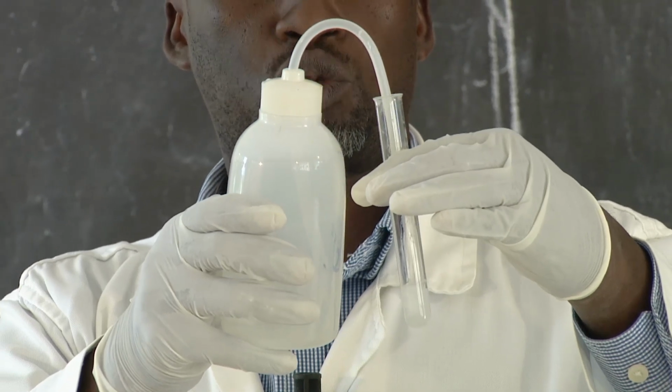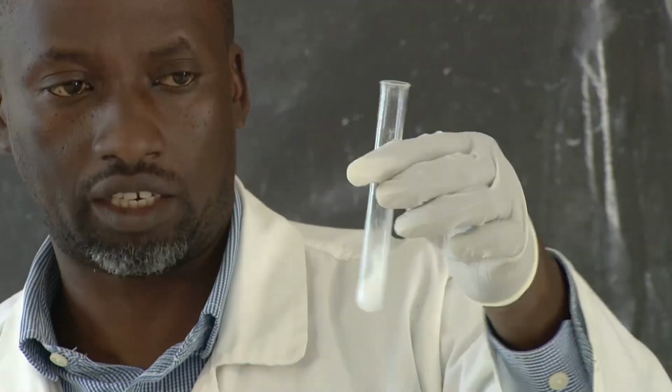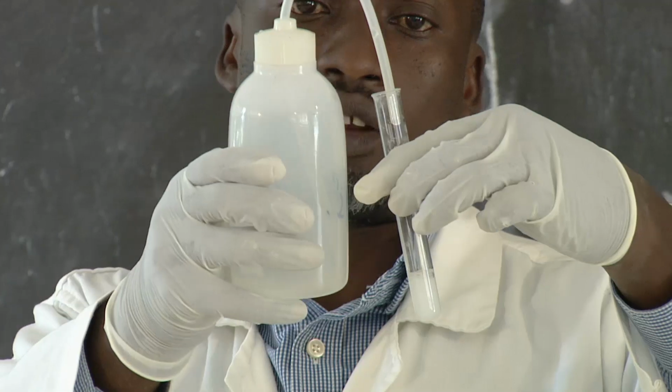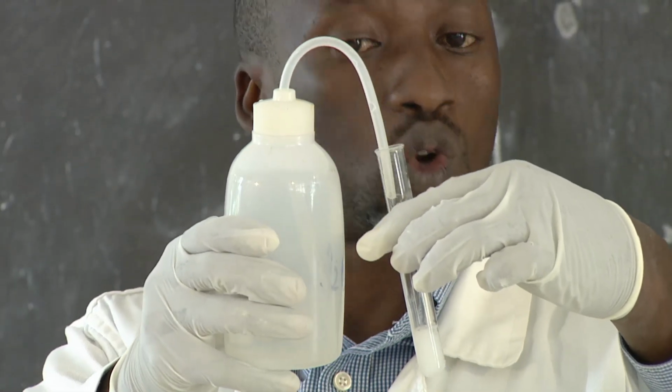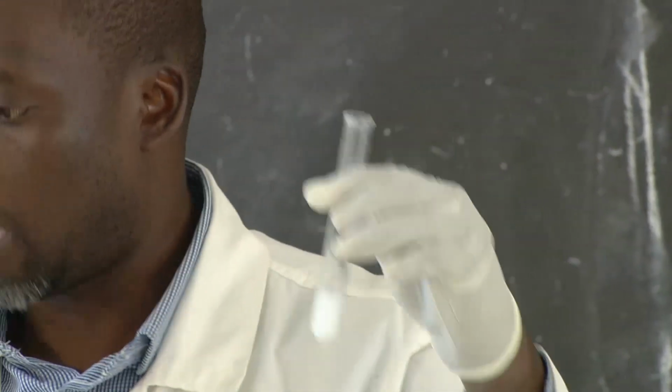And it is important to identify the color of the precipitate. So this is a white precipitate. You can just take a look at it. So that was barium. I'm just adding barium chloride to a solution containing the sulfate ions.